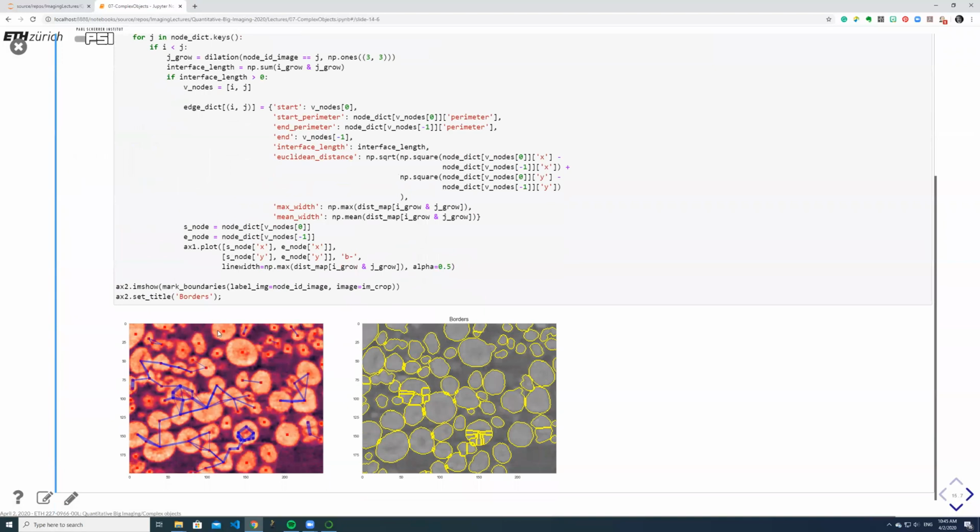And now comes a pretty big piece of code, but in the end, we come up with a graph where we see that we have connected items and see which ones are actually getting closer to each other. You can see that there are some pieces that are islands, like these ones out here. You can see that some are touching, and some are touching in a really complex network. So this is a way to start looking at how well connected this anode is. And in an anode, you want good electrical conductivity. So in principle, you want all items to be well connected.